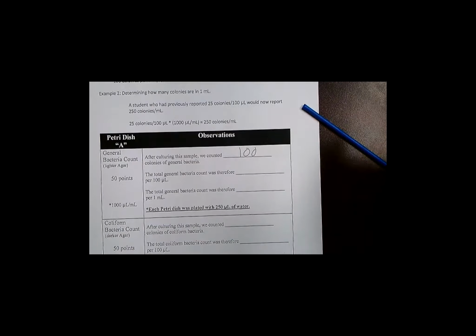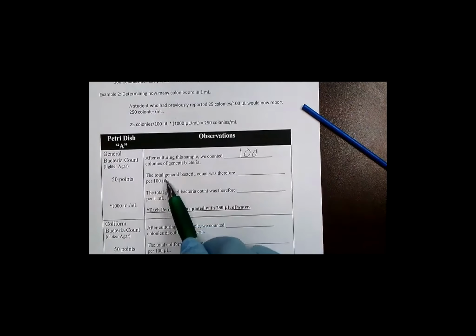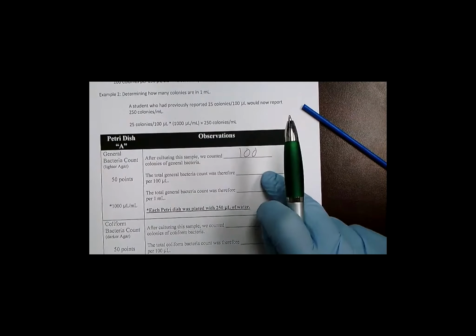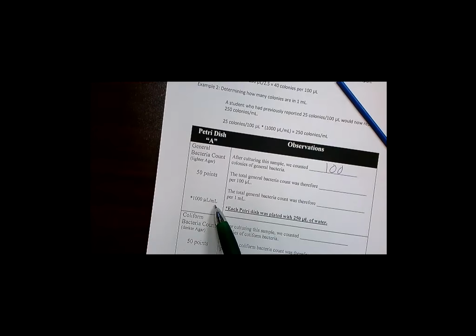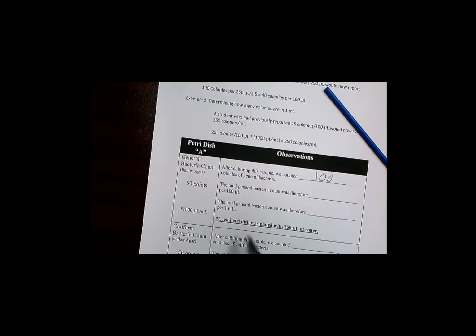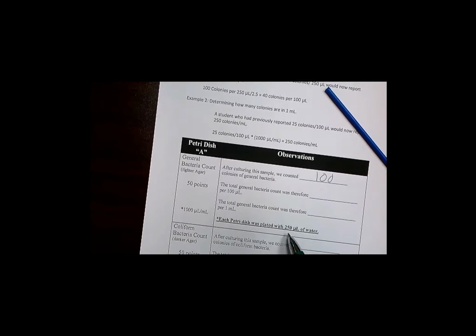Now the student has to do some calculations. They have to tell us the total general bacteria count was therefore X out of 100 microliters. Now, I've given them that 1,000 microliters is in 1 milliliter. They're going to have that, and you can work with them on that. And I also have here, each Petri dish was plated with 250 microliters of water.